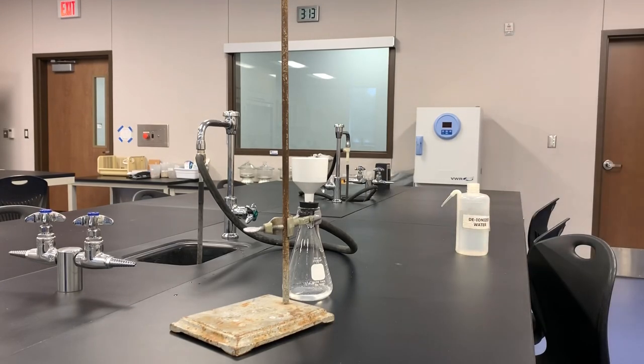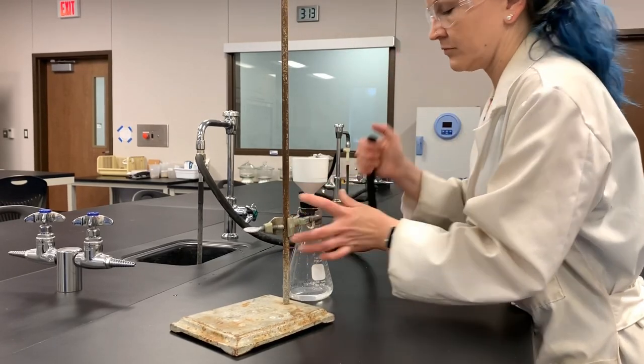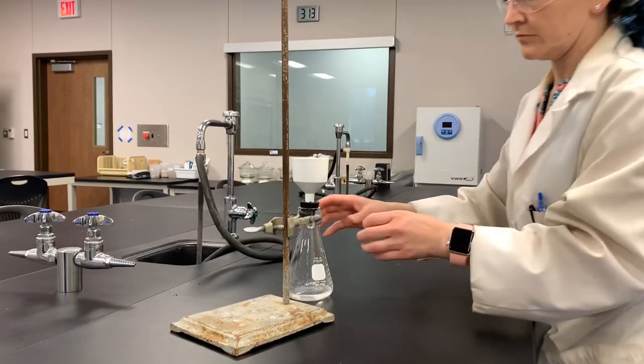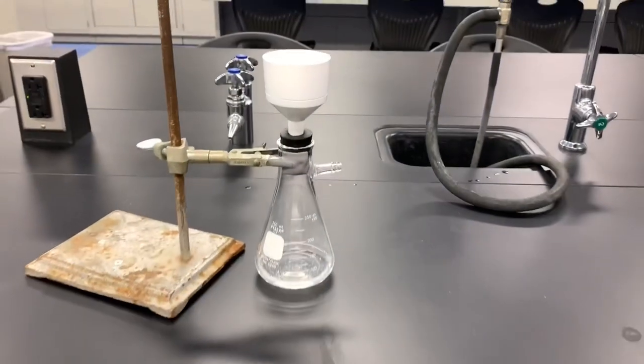The last steps of filtration are really important. Whenever you're ready to stop the filtration, you need to remove the vacuum tubing from the filter flask first and then turn the water off after that. You never want to turn the water off first because it's under a vacuum and doing so might send water into your filter flask.